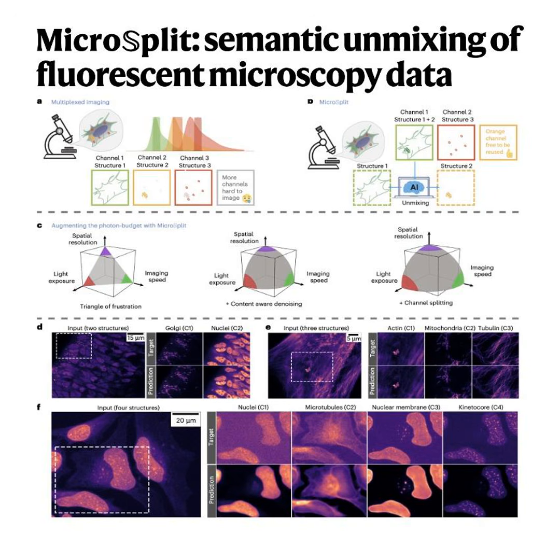So it's basically rolling the dice. Right. When it looks at an overlapping set of pixels, it effectively rolls the dice multiple times, sampling many different possible ways to mathematically unmix that specific area. So it's like asking a panel of 100 experts to independently draw what they think the unmixed structures look like based on a blurry photo.